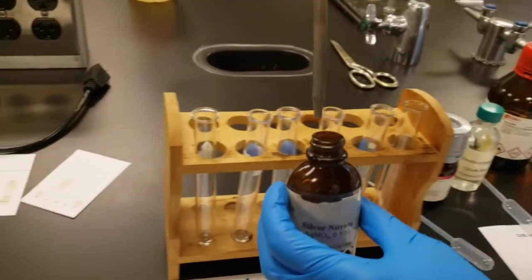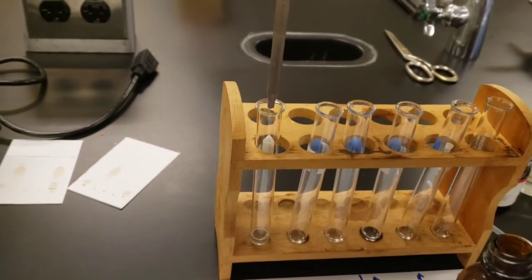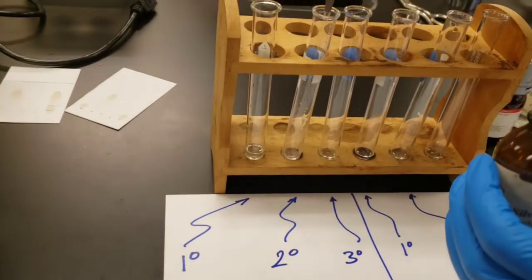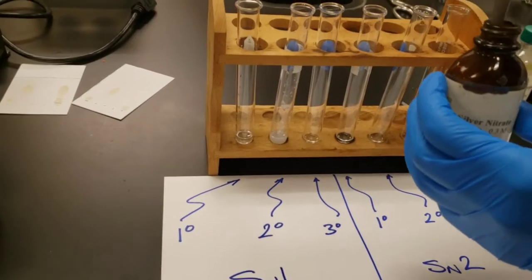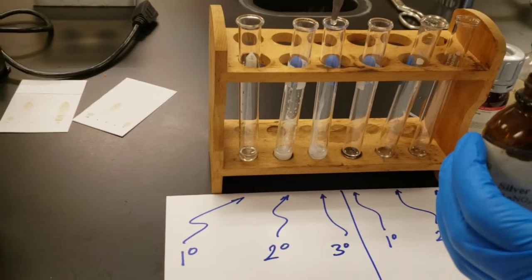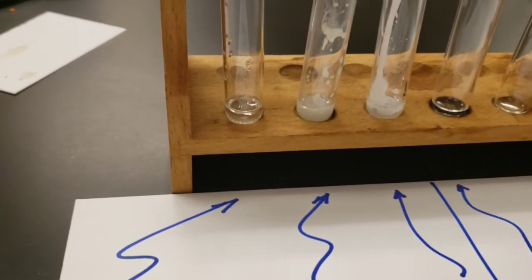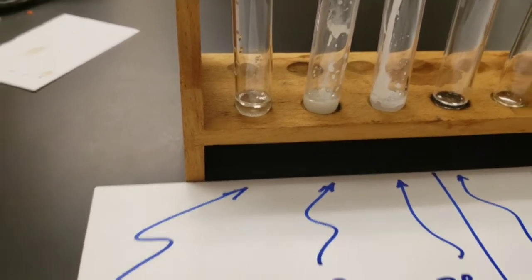Using the silver nitrate solution, we're going to add about a milliliter, perhaps 2, of silver nitrate solution to each of these 3 test tubes. The SN1 goes through a carbocation, which means that there will be free halogen in solution. Silver chloride and silver bromide and silver iodide are all insoluble in water.